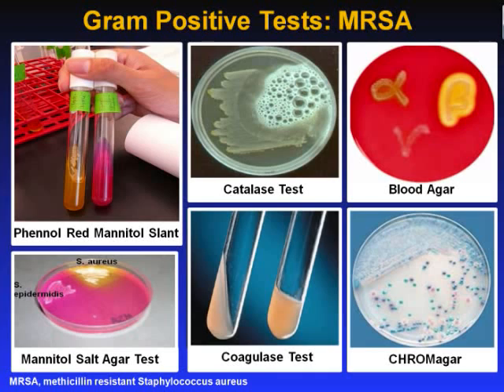Blood agar is used frequently to grow out most organisms, but it can act as a differential media as well. It differentiates bacteria on their ability to lyse red blood cells. The media contains sheep's blood and nutrient agar. If a bacterium lyses the red blood cells, then a zone of clearing is formed around the colonies. The zone of clearing can vary in magnitude based on the organism's ability to perform hemolysis.